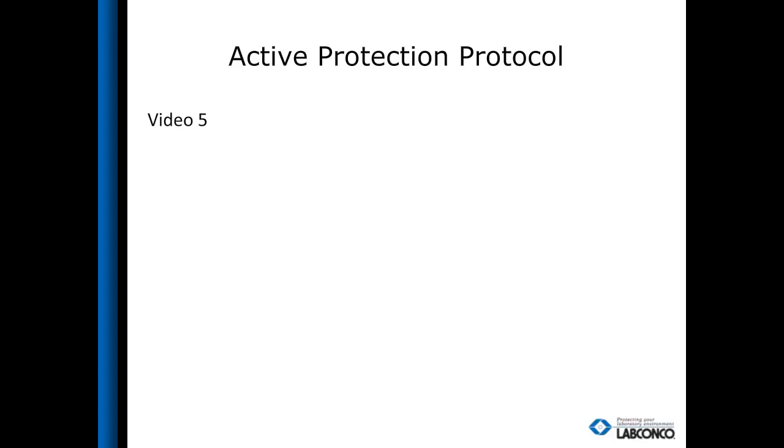Biosafety cabinet operators don't have that luxury. Oftentimes, they're dealing with chain of custody. They have to maintain assets, their biologicals, their samples, their organisms, whatever they're working with. Those infectious materials can't just be left in a dead air situation in a biological safety cabinet.